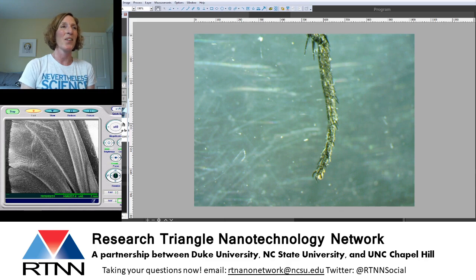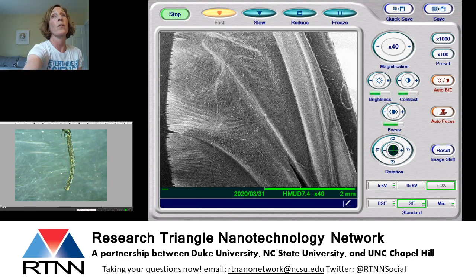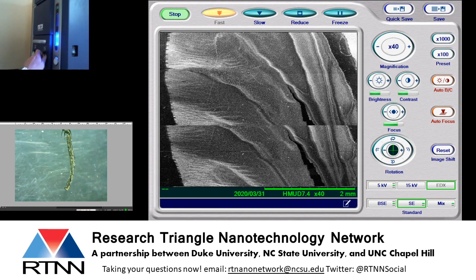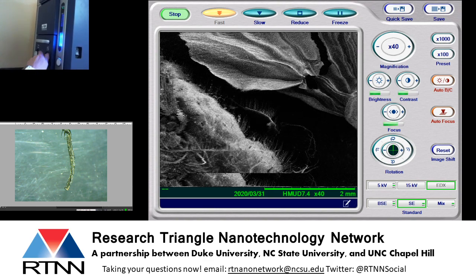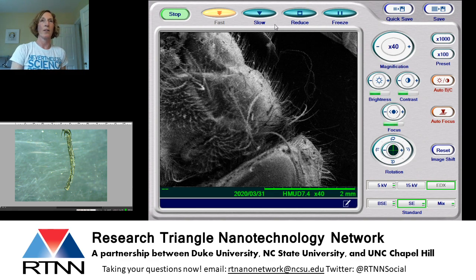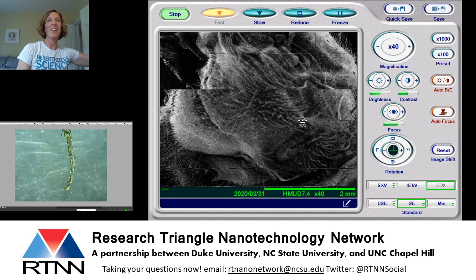So let's jump back again to our scanning electron microscope view. And now we gotta move to where the foot is. The one part of the microscope that we don't control with the computer is actually where we're looking. And so what I'm gonna do now is I'm gonna crank on this knob, and that is gonna move the stage. And you guys can watch us move across the fly here. You can see part of its body there as we're moving. Its body is very hairy looking. I'm going to move this back down so I can do everything at once here. Let's go back this way. Oh, look at that fly body. It's pretty hairy and pretty gross and pretty awesome all at the same time.